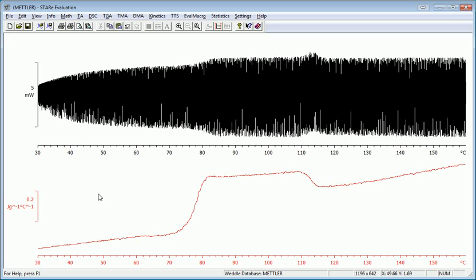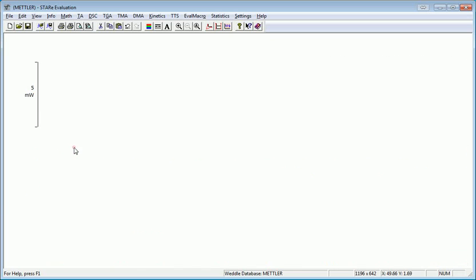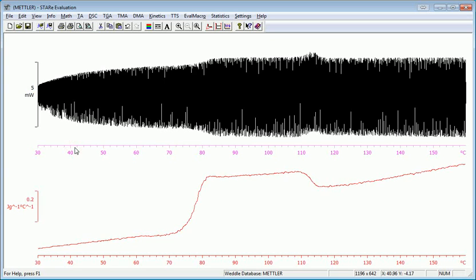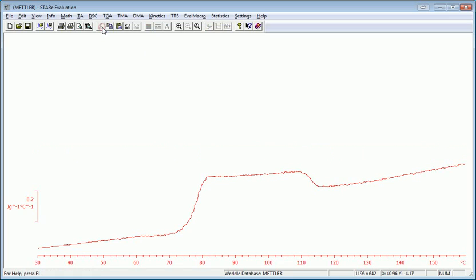So now I'm going to just get rid of the top curve, because I don't need it anymore. So I'm going to select an axis and choose the cut button.